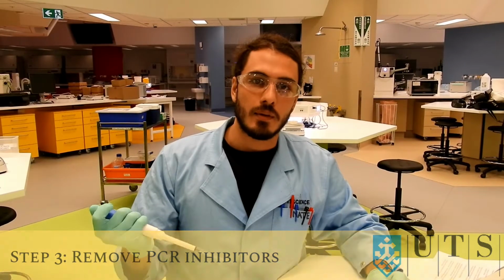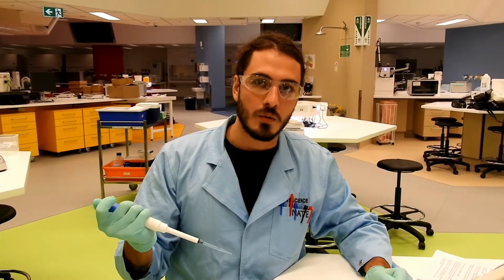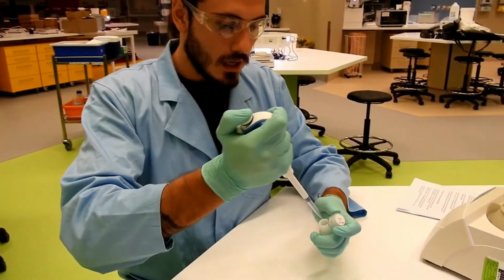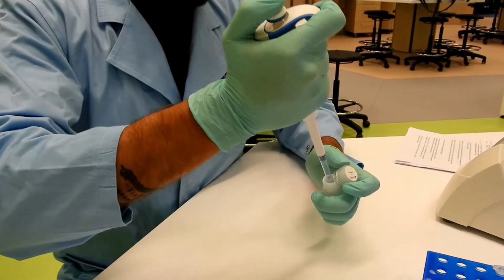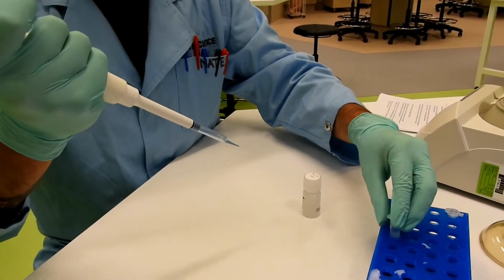Next, we need to remove chemicals that inhibit downstream processes like PCR. To do this, we'll use our inhibitor remover reagent, which removes inorganic materials from our sample. We'll pipette 250 microliters into our sample.